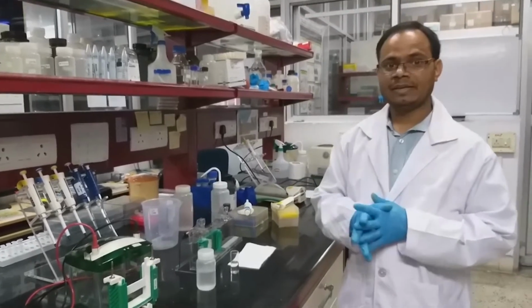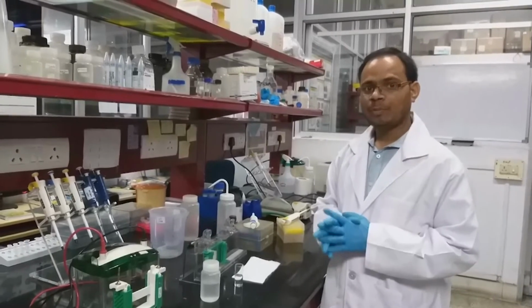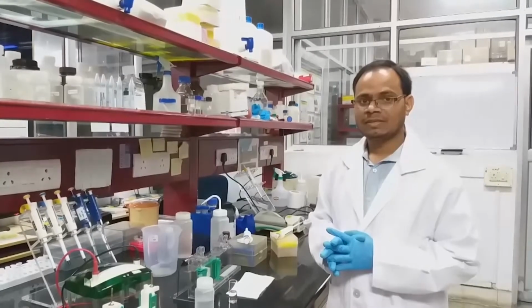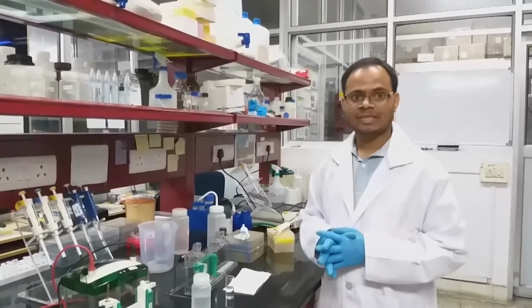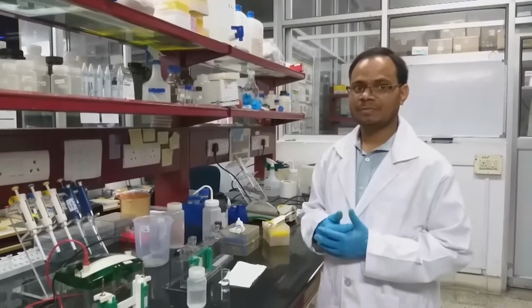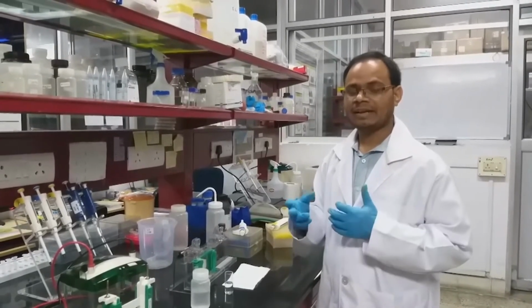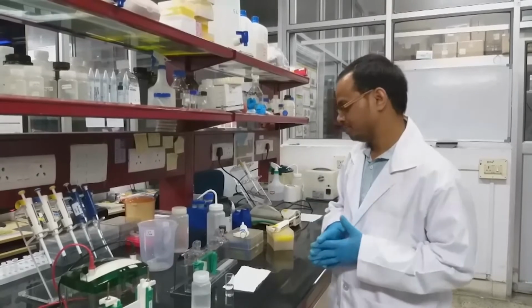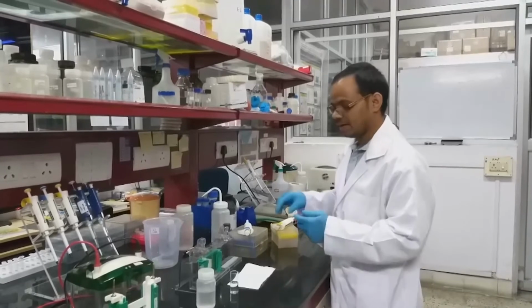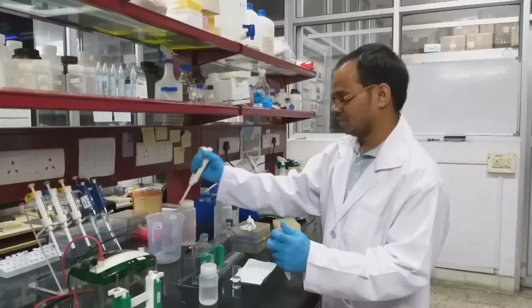The other important thing is 10% ammonium persulfate. Ammonium persulfate, which is catalyzed by the TEMED, provides free radical species which accelerate the formation of the mesh-like structure in acrylamide gel. It will catalyze forming the mesh. So this is the 10% APS. I just add 100 microliter of 10% APS to the resolving gel.